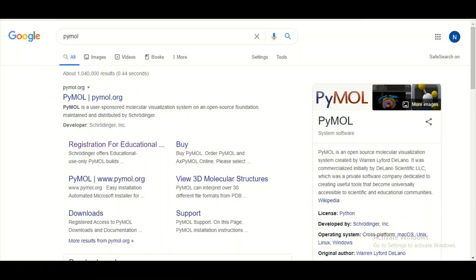There are two different versions of PyMOL available. One is for educational purposes and is free of cost, and the second is for commercial purposes, for which you need to pay. For this tutorial we are going to use the PyMOL version for educational purposes.